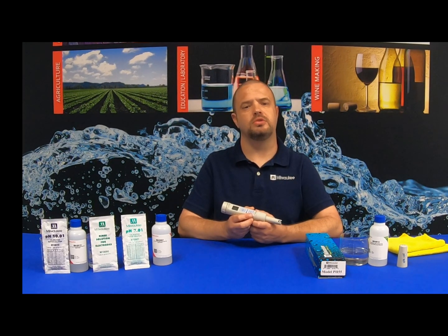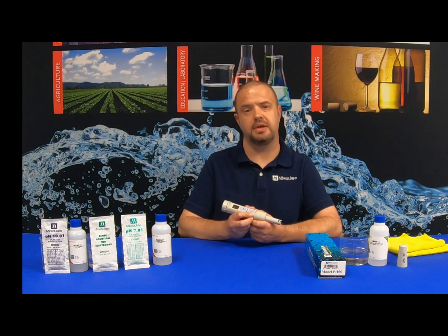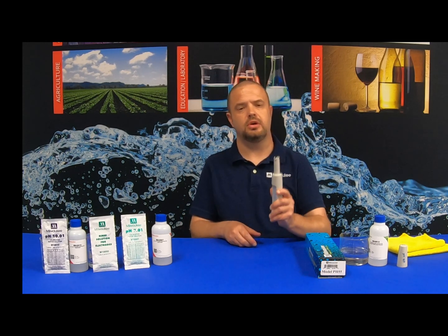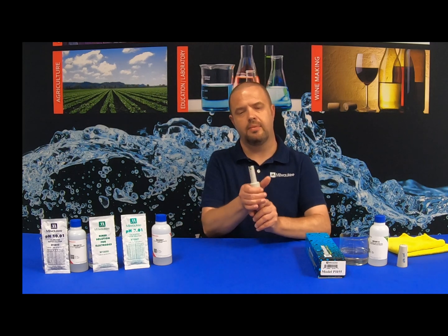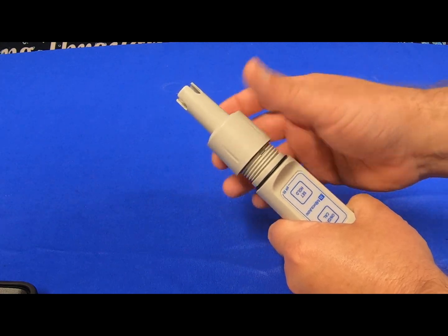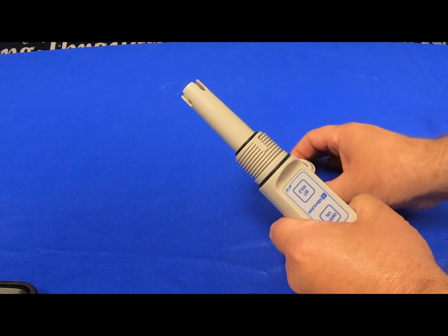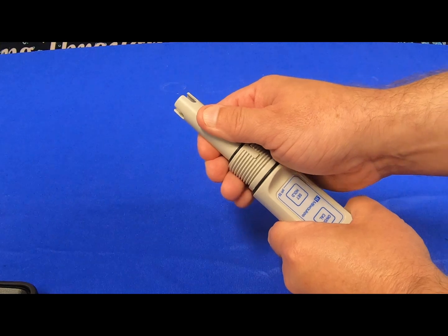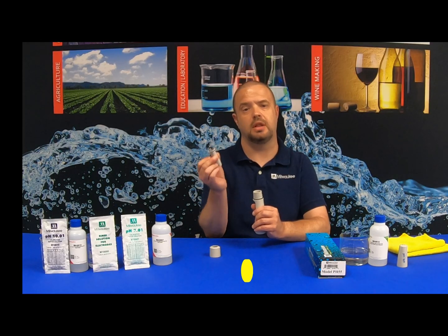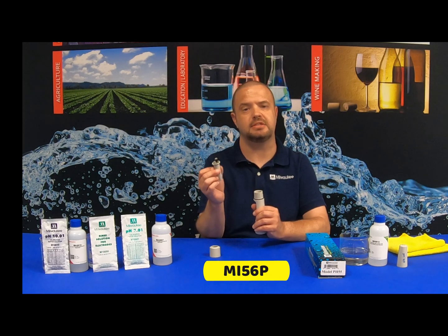With all electrodes and probes over time, like batteries, they lose their juice. So eventually you will have to replace the electrode on your Milwaukee Instruments PH55 unit. To do so, turn it up where the probe is facing up and unscrew the locking collar. Simply twist it off and remove. The electrode simply pulls away from the base unit. The model number of this replacement electrode is MI56P.